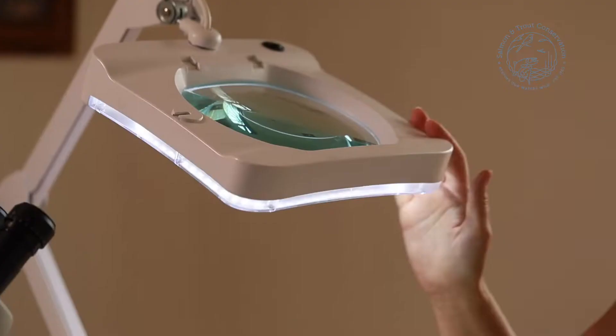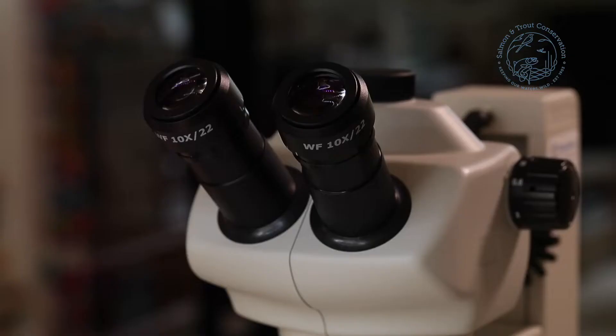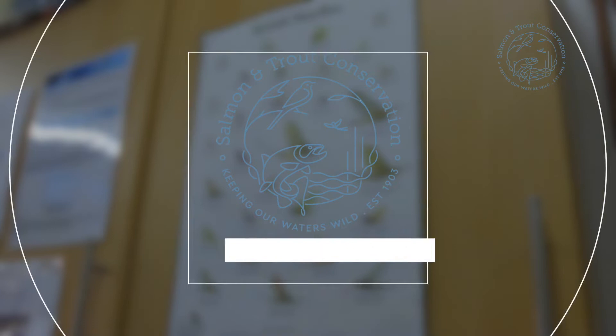We have our magnifying lamp so that we can see everything in our tray. It gives us the light and we can also bring it down and look through the magnifier to see any of the animals that we might have missed. This is a stereo low power microscope, up to times 40.